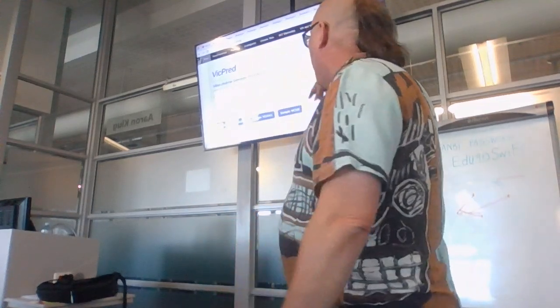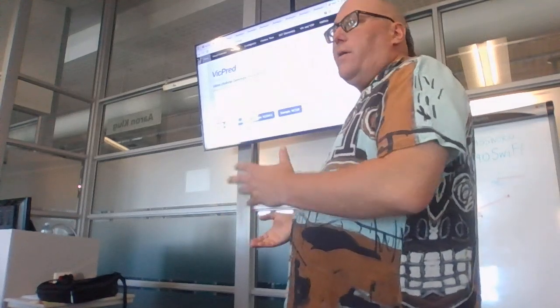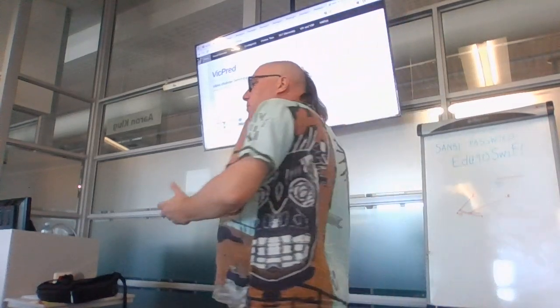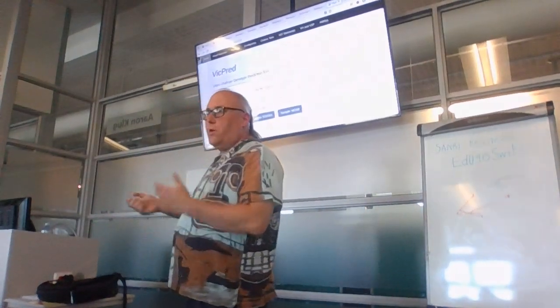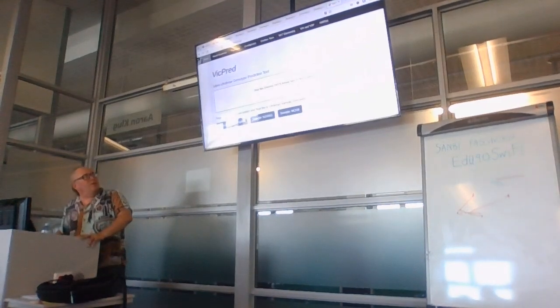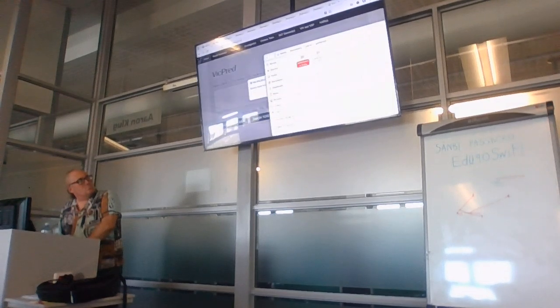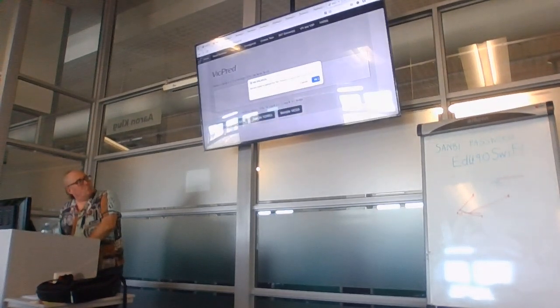Okay. What I like about this, when we do get access to this, it will allow us to run more command line tools to characterize Vibrio cholerae. At the moment, there's not a lot of command line tools that you can use on Vibrio cholerae. But this one, to me, is really slow. It works on a single genome at a time basis. And so you can only do one thing at a time.